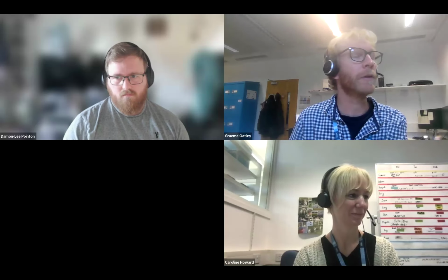Have you sequenced sharks? I don't know if we've had sharks yet. Have we? Amy will know. She does our coordinates. Sorry, can I just ask quickly, what sort of sequencing are you doing? Yeah, so we are sequencing Oxford Nanopore, so we know it's more tricky.